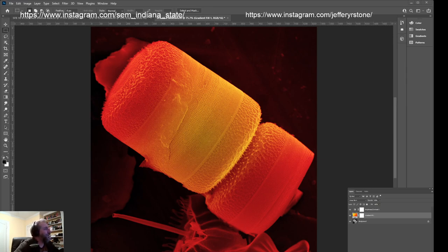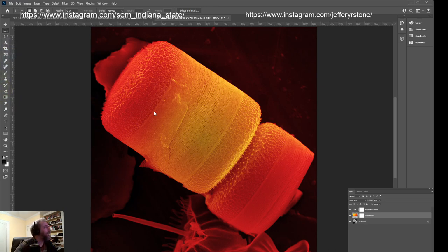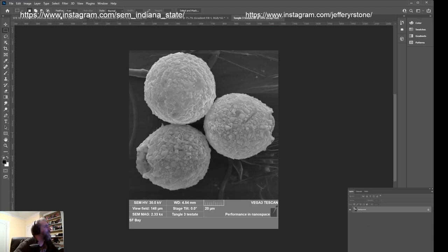They make little hard shells and crawl in. Testate amoebas. Actually, I have some pictures of testate amoebas from the SEM. If you give me a second. Let's see, when Pacific Plankton came to visit me a couple of weeks ago, we looked at some testate amoebas, and I can just drop them right into the Photoshop for us.